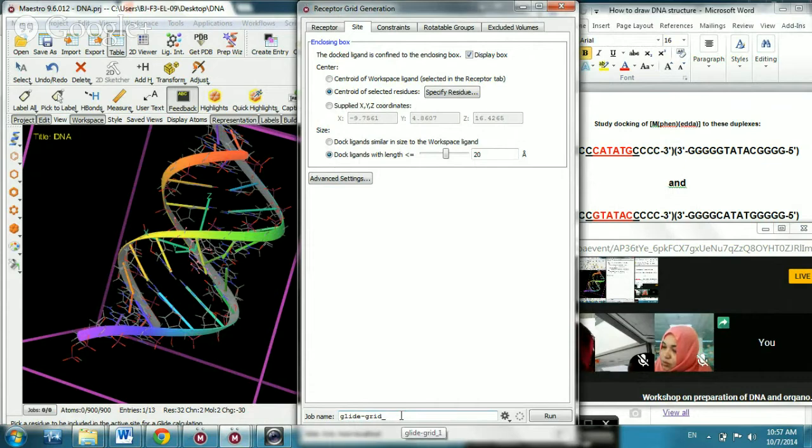After you click OK, you give the name here. For giving the name, what is the thumb rule? We just remove the numerical number and give the name. So you can give it as DNA. And what is today's date? Today is 10th. We can give today's date as well. 10th, 7, 14, and then we click run.